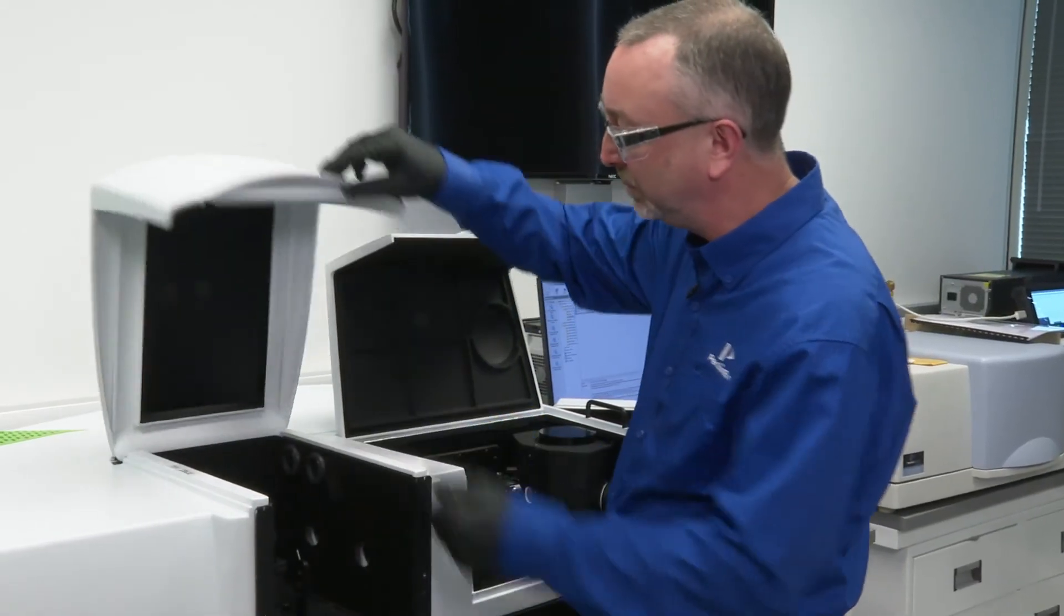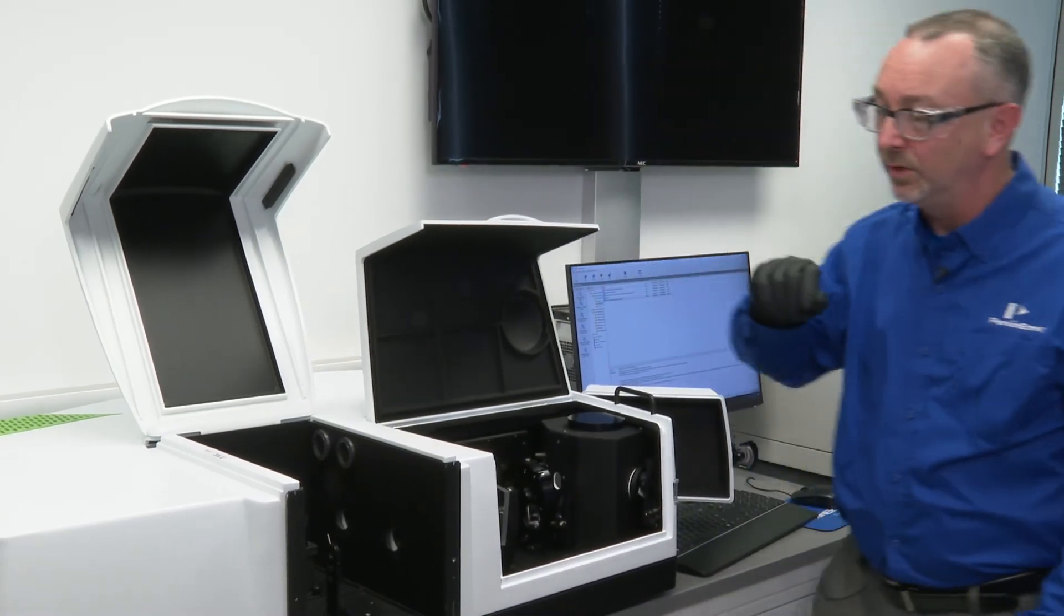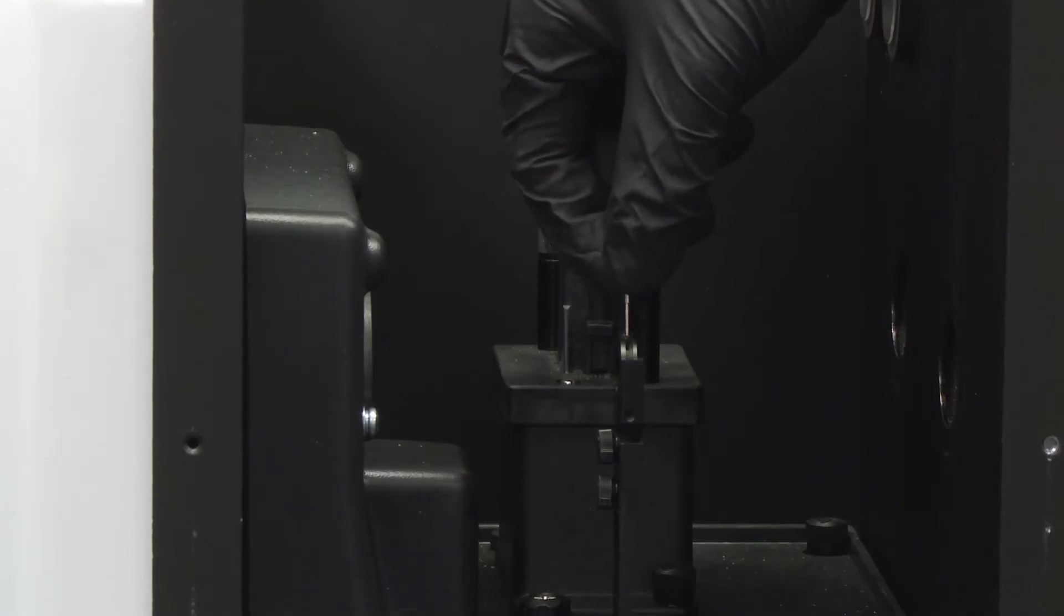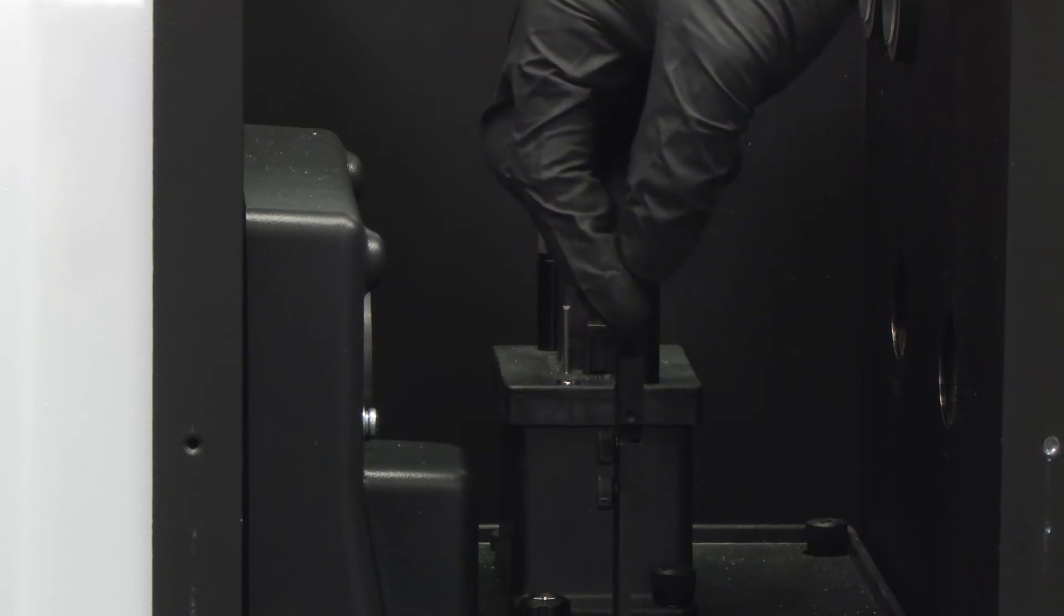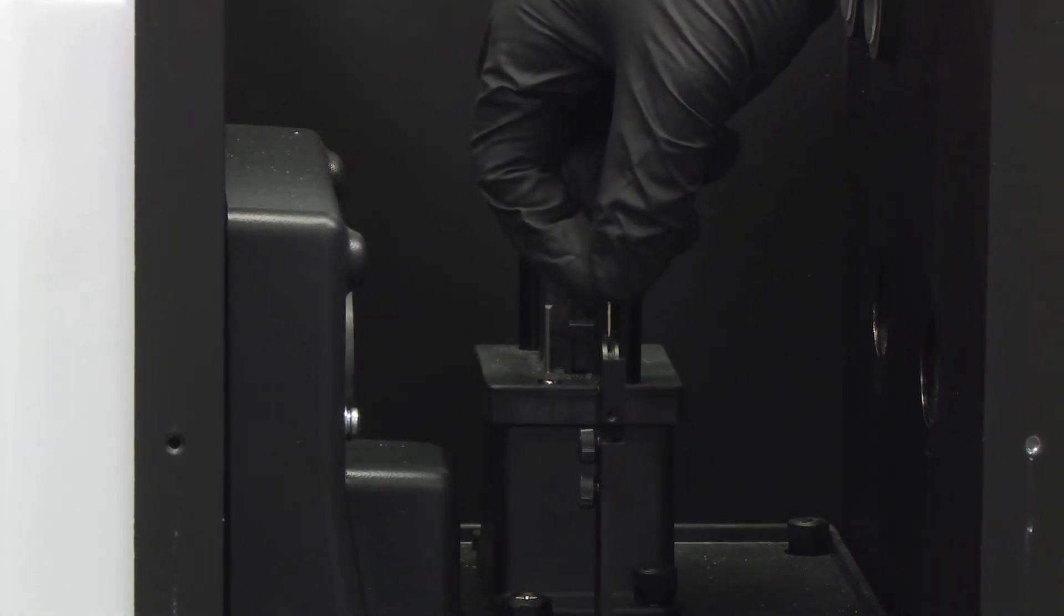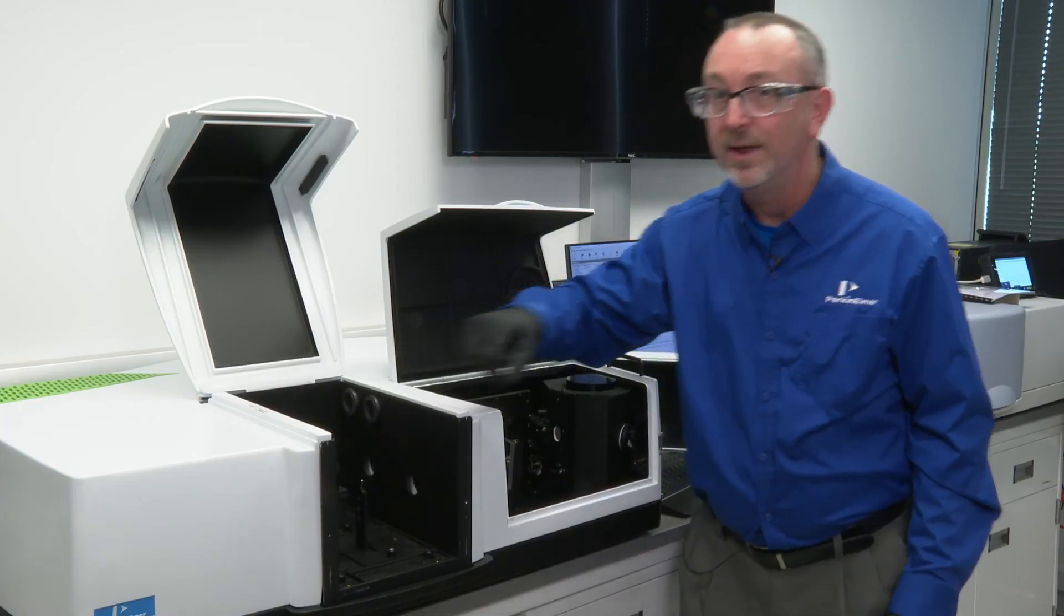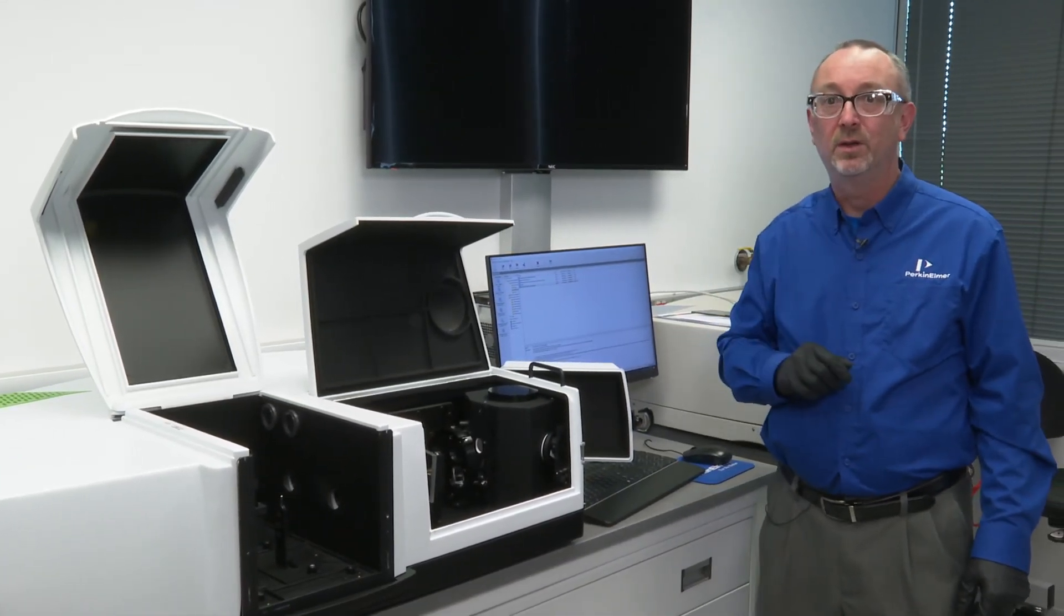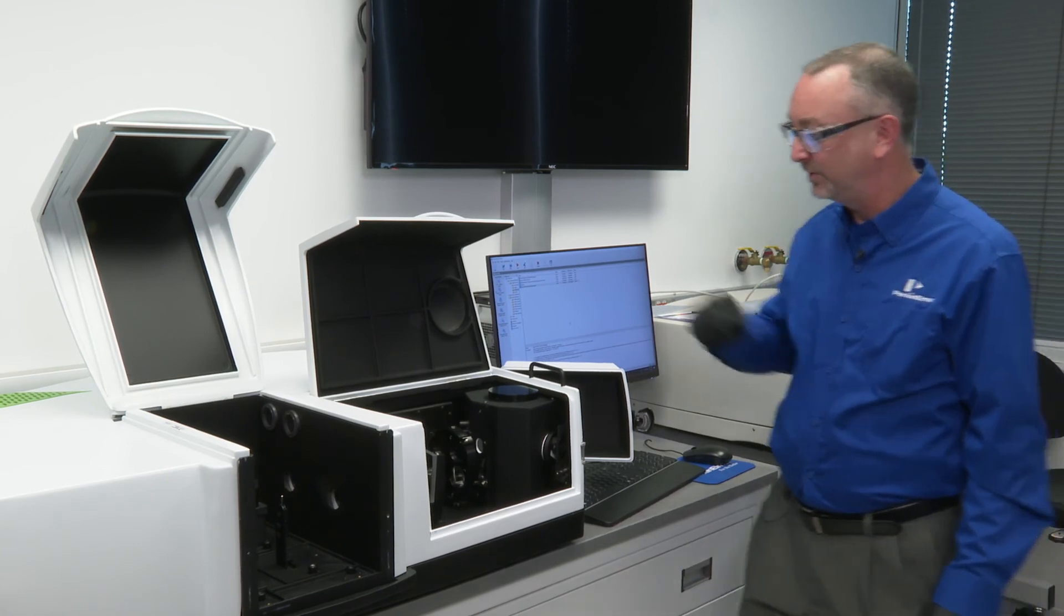In conjunction with that, in the sample compartment, we sometimes use, but not always, what's called an iris aperture. This allows us to modify and mold the beam spot to more accurately interact with the sample without impinging upon the sphere itself.